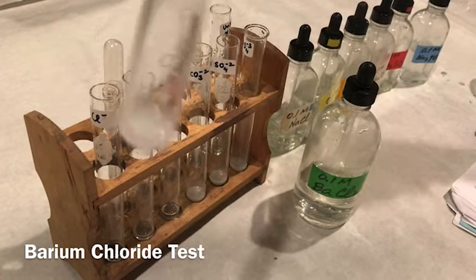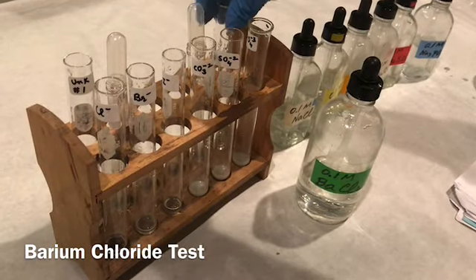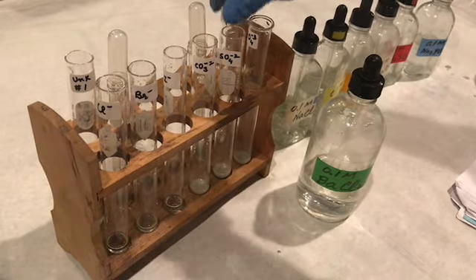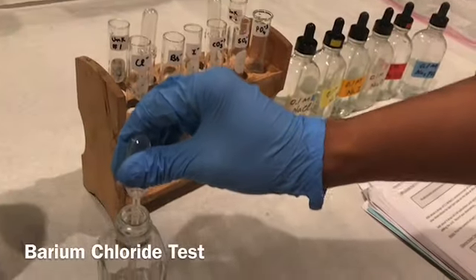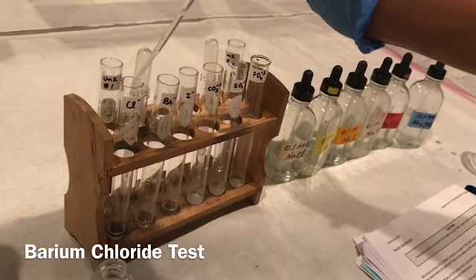unknown number 1, unknown number 2. Okay, so now I'm going to add hydrochloric acid in each of the test tubes.